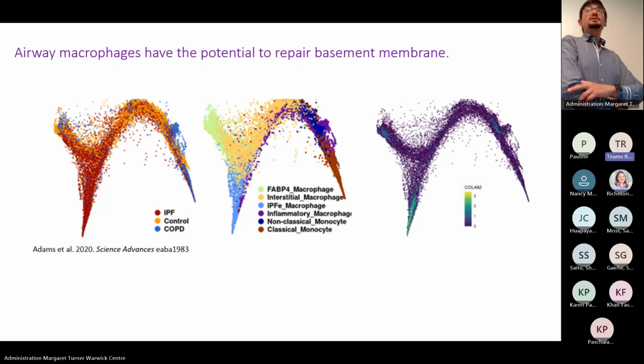So what you're seeing really is a picture of the entire protein. Imagine a scenario where the basement membrane is damaged and you're seeing disassociation or degeneration of the collagen 4 network, so the cells don't have anything to adhere to. So what are they doing? They're laying down a pericellular matrix like fibronectin instead of adhering to a basement membrane, which is what we see. All those glycoproteins go up. And the way that they adhere to that pericellular matrix is very different to the way they would adhere to a basement membrane, and that's reflected in the structure of the cytoskeleton.